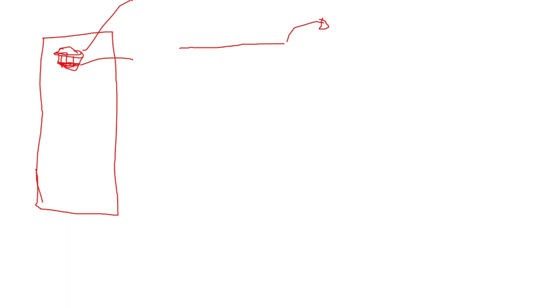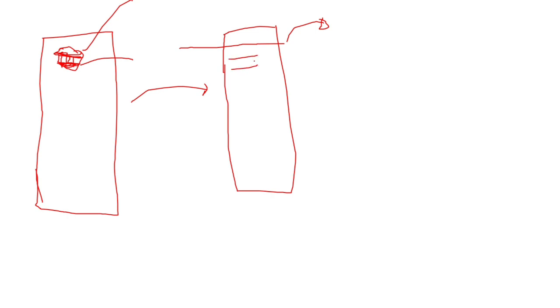So this probe is now hybridized with our RNA. Now we will add washing buffer, which is going to wash off all the unhybridized RNAs. So now we are left with only the hybridized RNA. Okay, now using autoradiography, we will be able to visualize the RNA.